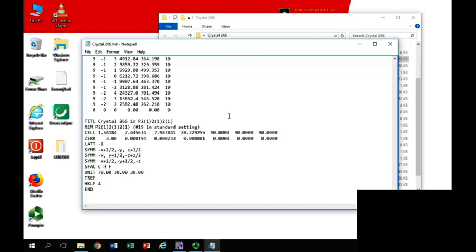And I did see a paper to referee a few months ago where the authors had said that when they had substituted a hydrogen atom for a methyl, they went from P21 upon C to I2A, a completely different space group. So, obviously a different crystal structure arising from the addition of a methyl group.